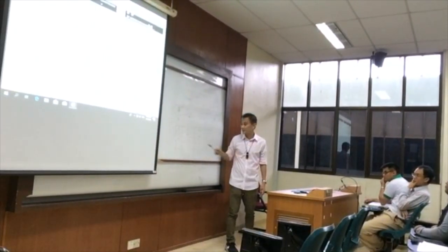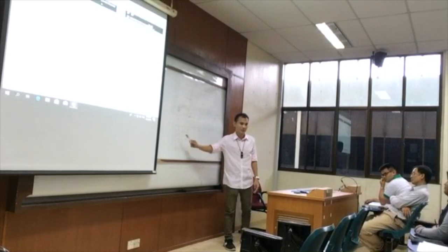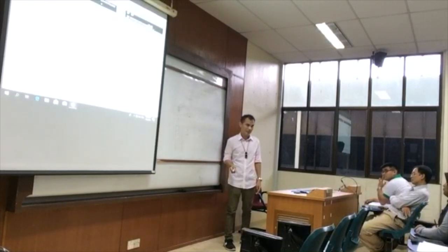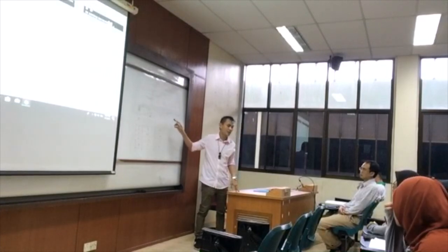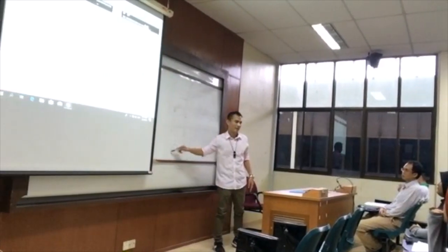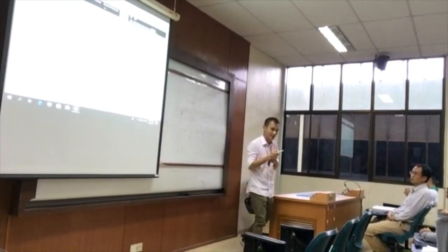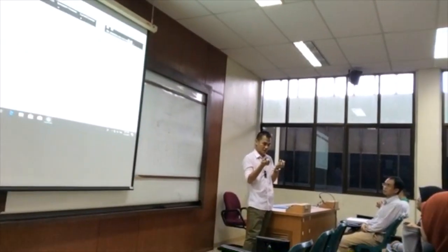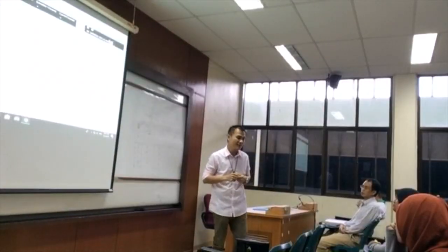Okay? So if this case happens, what is the case? Contamination from either this one or this one. Okay? So it's important for you all to think of all the possible scenarios of your results. But how do we get these results? We're going to do polymerase chain reaction first, and we're going to view the results on electrophoresis.